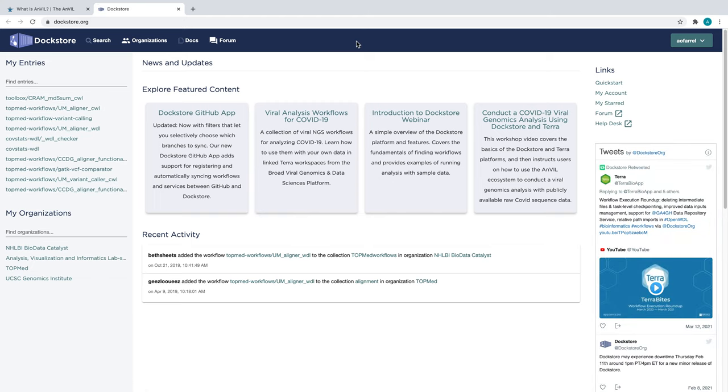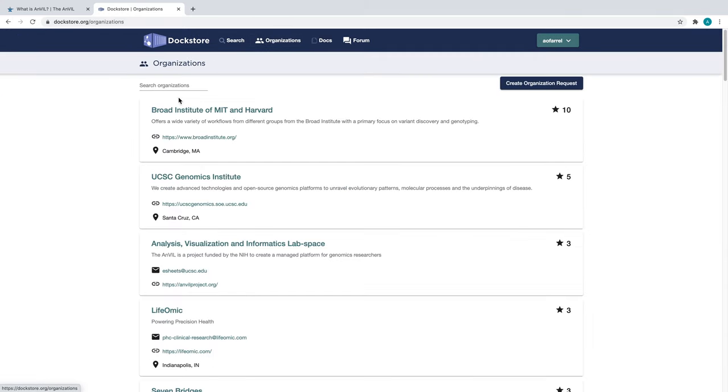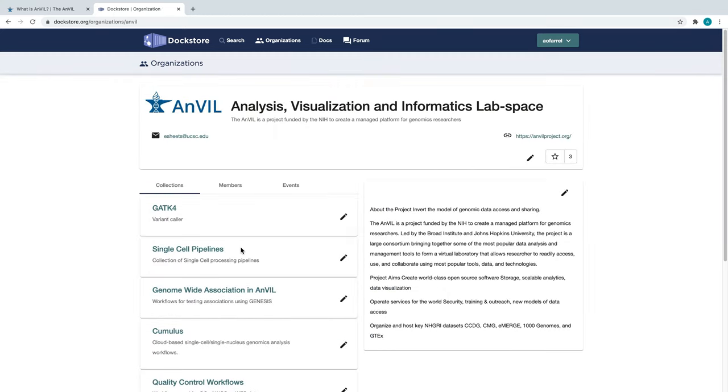Now, we have arrived at DocStore, the home of hundreds of workflows. But today, we'll be focusing only on workflows shared in the Organizations and Collections feature on DocStore. Anvil has an organization on DocStore that contains several different collections for different analyses. These collections all contain workflows written in the Workflow Description language, also known as WDL, which is compatible with the Terra compute environment.